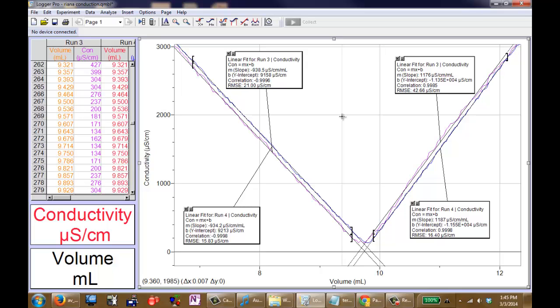The points we're looking for are the points where the straight lines of best fit intersect at zero.